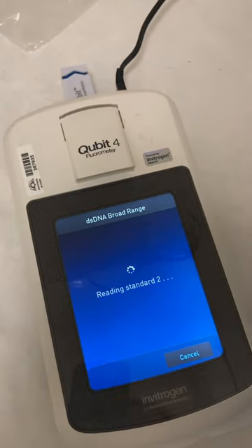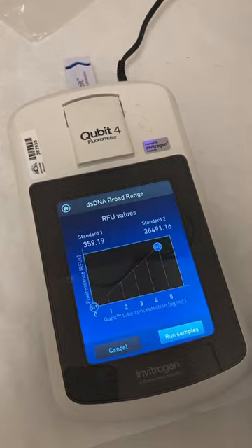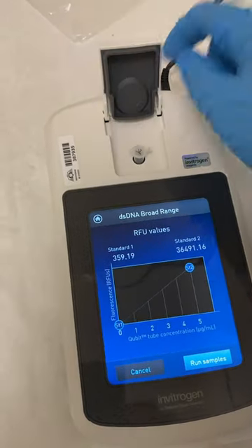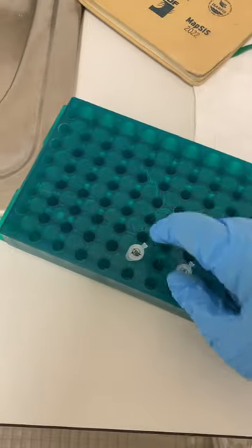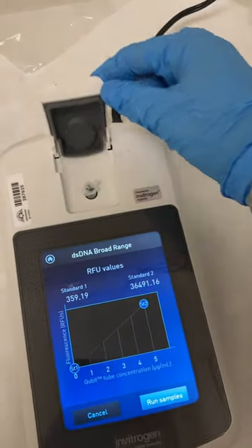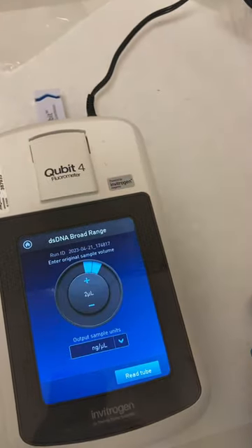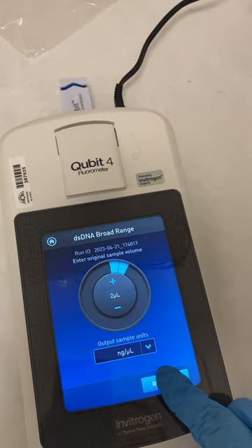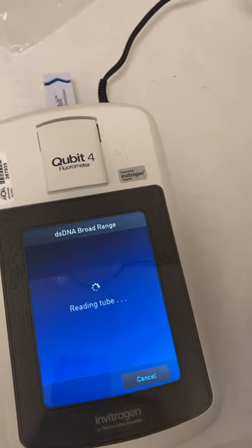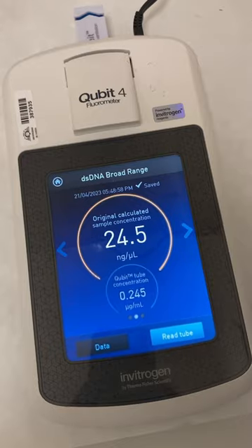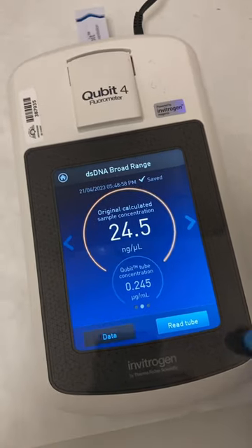We read the second standard, and then we put our sample in — in this case we only have one, so the sample is number two. And this is our result.